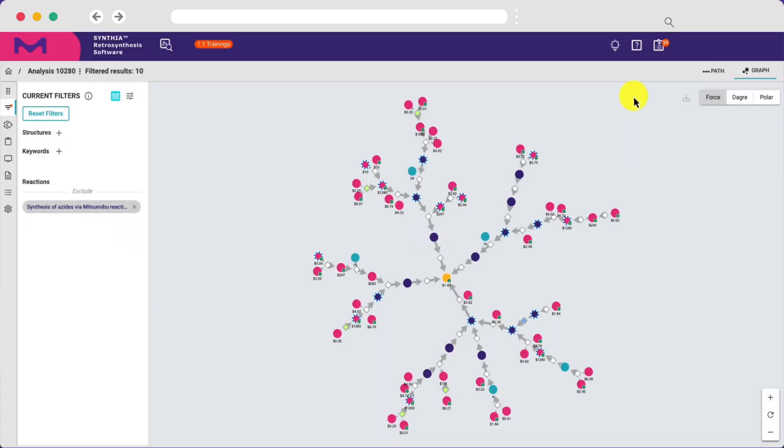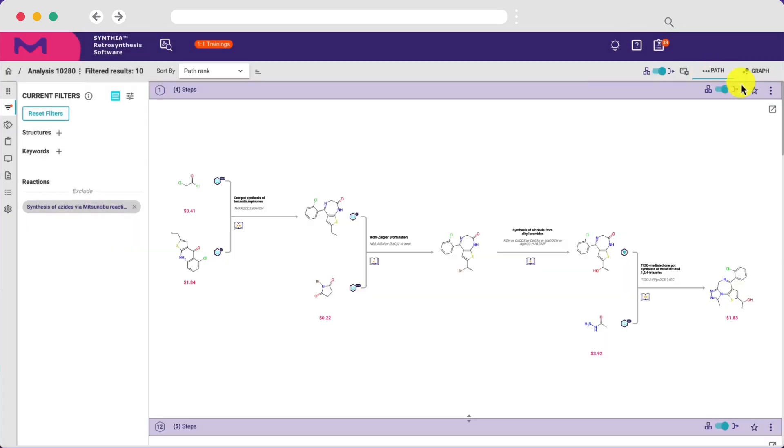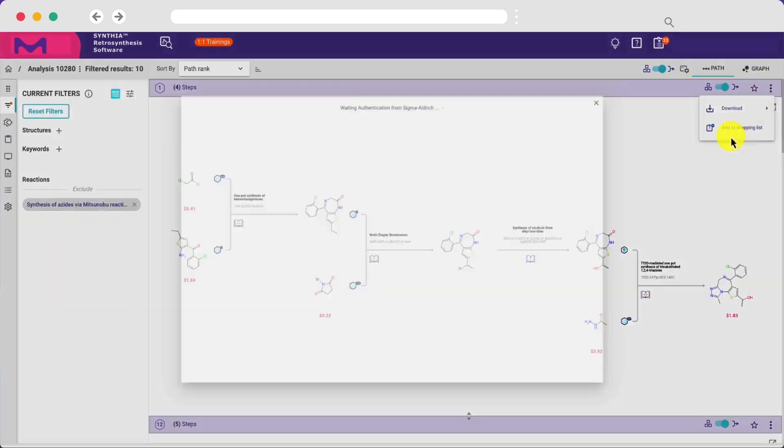Once you select a pathway, you can quickly move to benchtop execution by accessing commercially available reagents directly through the software.